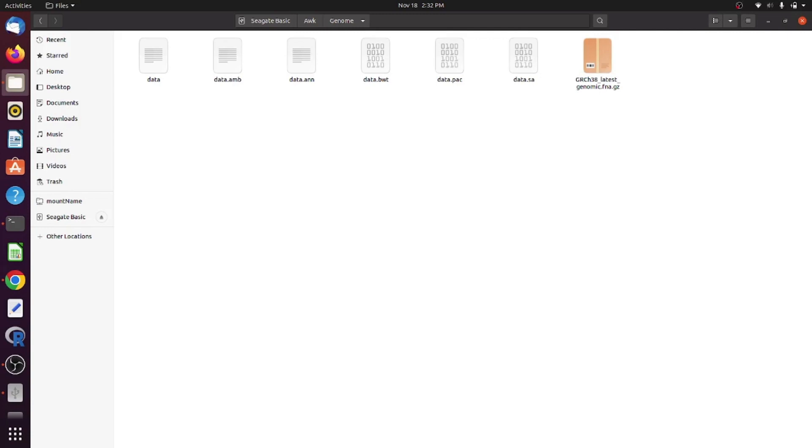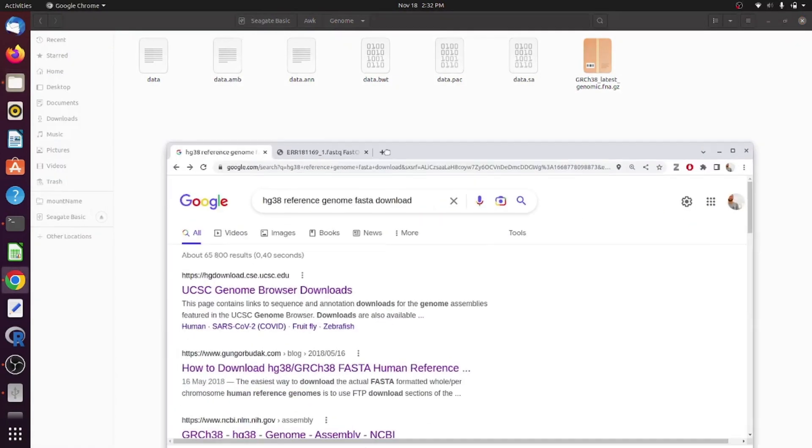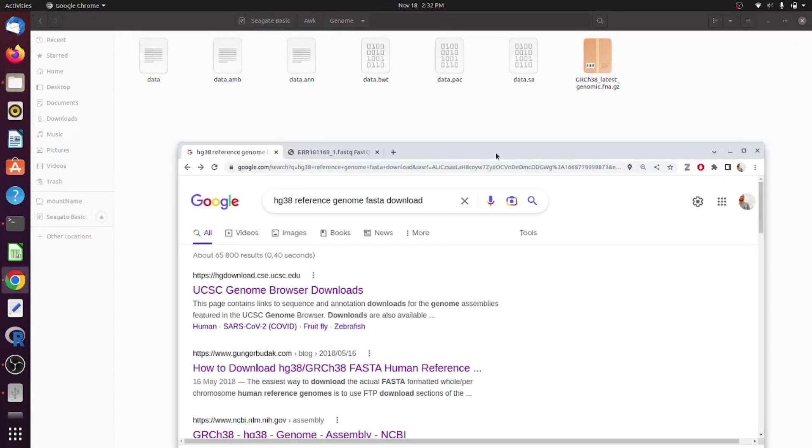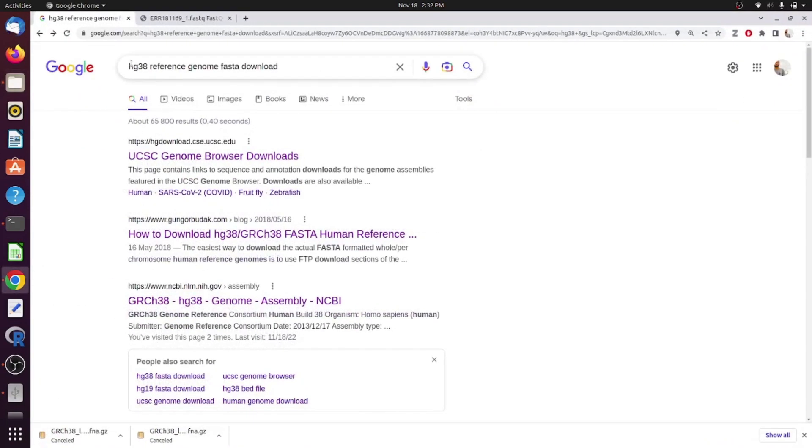As you can see here, I have downloaded GRCH38 or HG38 genome.